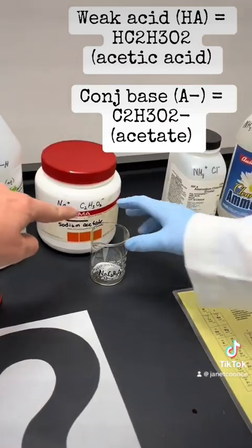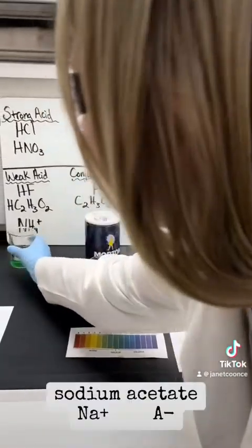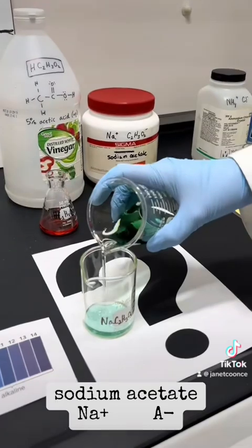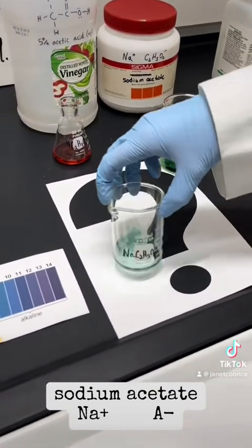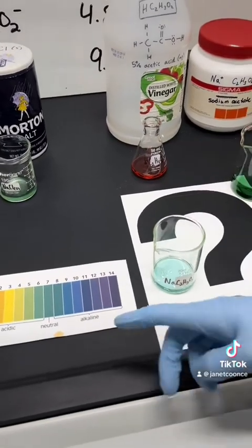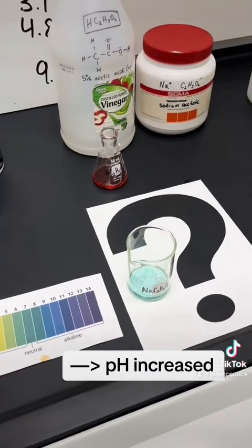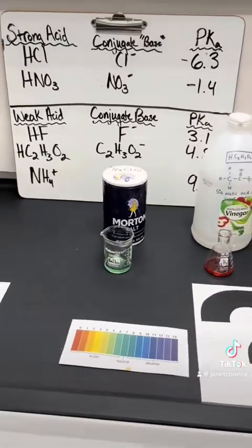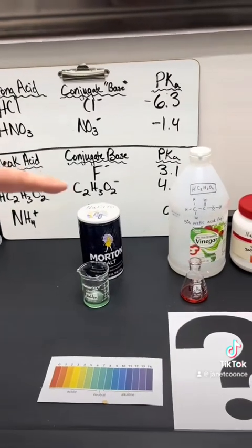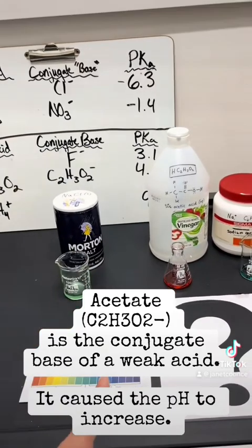And we want to know what is going to happen when we take the conjugate base of that weak acid. So a salt, sodium acetate. We're going to add some. Isn't that cool? So what do we see? We see that it's a light blue color, and so what happened to the pH? We can see that from the light blue color, it's more basic. So the pH increased. Anytime you have a weak acid, if you have a salt of its conjugate base, then that conjugate base will cause the pH to increase to become more basic.